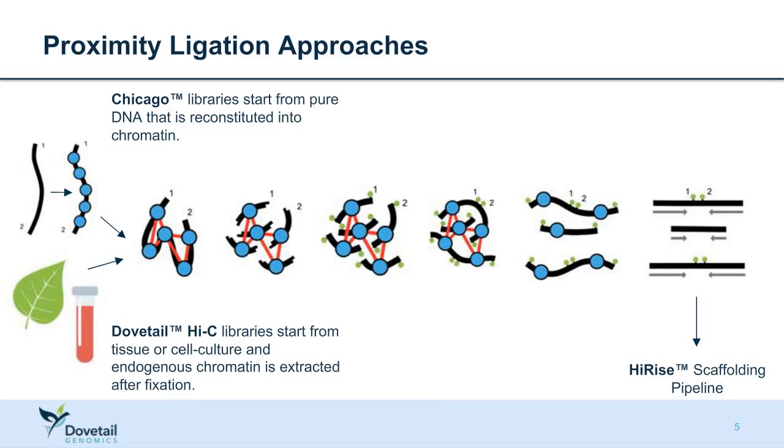Okay. With all these things, a lot to handle. So let's go into the science, the molecular part of this proximity ligation approach. Why is it important? Because we want to share with you how this can help with genome scaffolding. In this slide, it's a little bit busy. I have a cartoon illustrating the different steps in this approach, all the way from left to right. From the left, you have DNA, and all the way to the right, you have data coming out from sequencing.